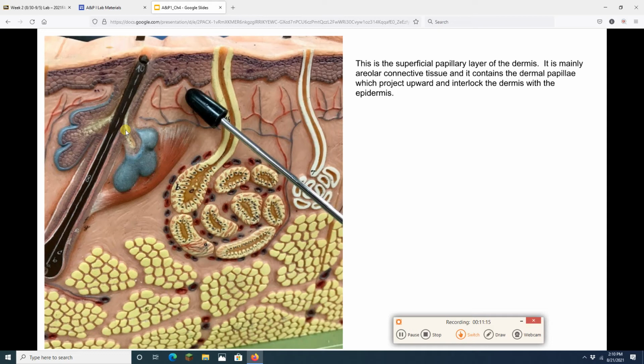Okay. Is this still thick skin, or did I switch it back to thin skin? Definitely thin skin. How do we know? We can see this hair right here. We can also see that it is just a thinner epidermis, especially that stratum corneum. Now, right now, my pointer is in the dermis. Remember that deeper layer of the skin? In fact, this whole stretch, like all the way down to where I have the yellowish stuff.